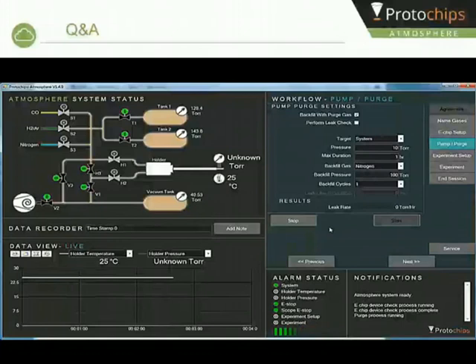Fantastic. This one maybe everyone can comment on. The user is asking, how do you make real catalyst specimens thin enough for the cells? I think the essence is that when you disperse the catalyst powder onto the membrane, and this is true for any TEM imaging, if it is a powder, all you have to do is make a dilute dispersion and spread it out, and then it is thin enough. If it is a monolithic catalyst, you'll have to do some preparation. Perhaps Larry can say something about microtoming and the other techniques that one might use. You wouldn't use microtome techniques in particular for these kinds of experiments. We just use catalyst powders, and we make sure the aggregates are small enough that we don't have an aggregate larger than 5 microns, because that would make contact between the heater and the bottom window. So we make sure the dispersion is such that there are much smaller aggregates of material on the heater.